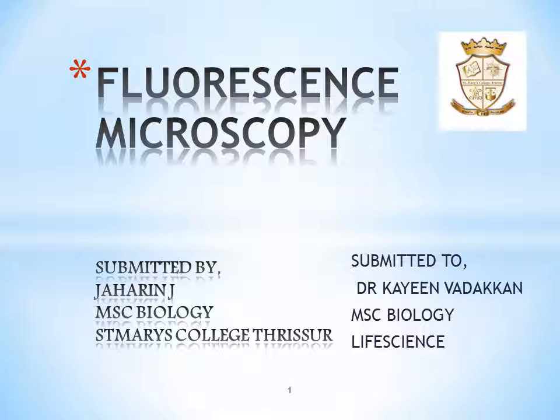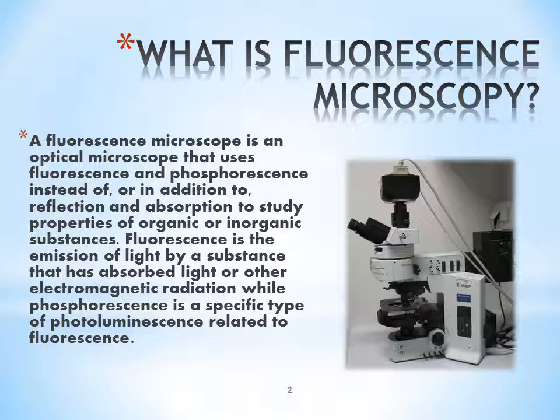Today we are going to discuss fluorescence microscopy. Let's see in detail. What is fluorescent microscopy? A fluorescent microscope is an optical microscope that uses fluorescence and phosphorescence, in addition to reflection and absorption, to study the properties of organic or inorganic substances. Fluorescence is the emission of light by a substance that has absorbed light or other electromagnetic radiation, while phosphorescence is a specific type of photoluminescence related to fluorescence.